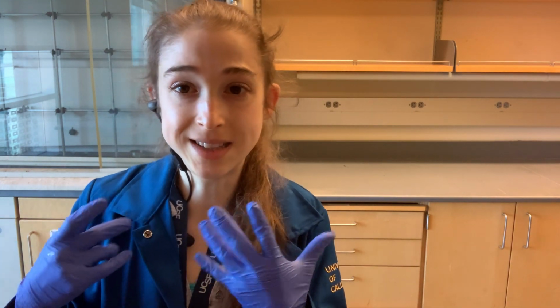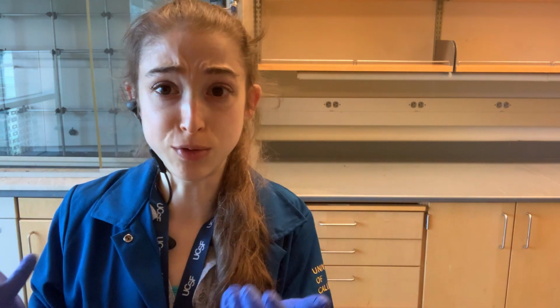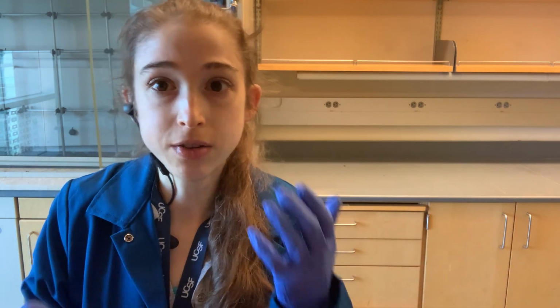And so you might see protocols that say to incubate at 20 degrees C, and you're like, well, that's room temperature, right? Well, room temperature, remember, can vary, and so you want to actually be able to keep it at 20 C. So there are various methods that we can use to keep things at really specific temperatures. So let's start with this.